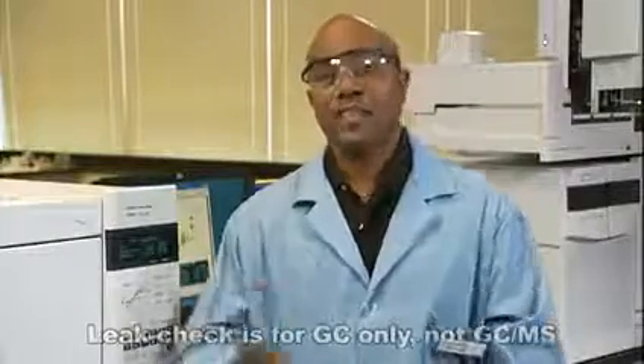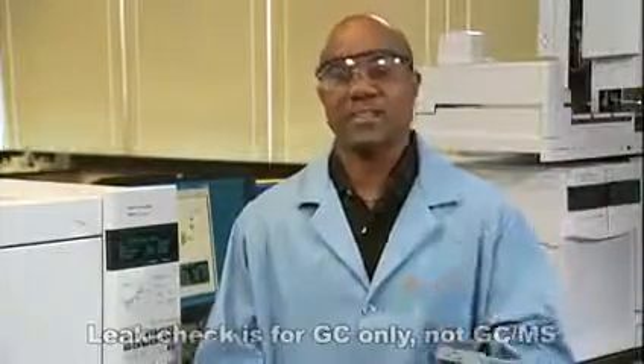There are three things I like about this test. It doesn't take much time. Also, it uses the GC flow sensor to measure the leaks, and you get feedback when you find and fix the leak.